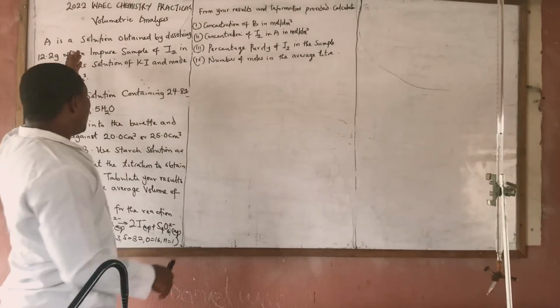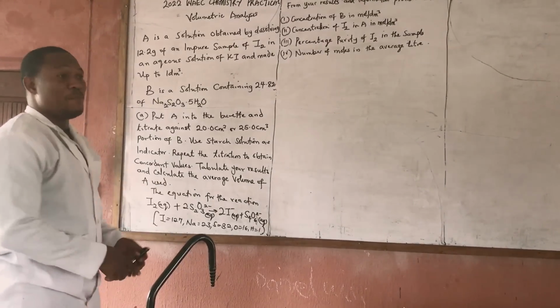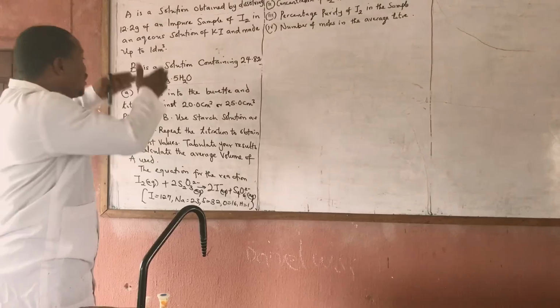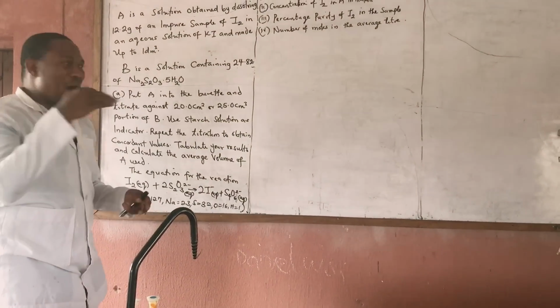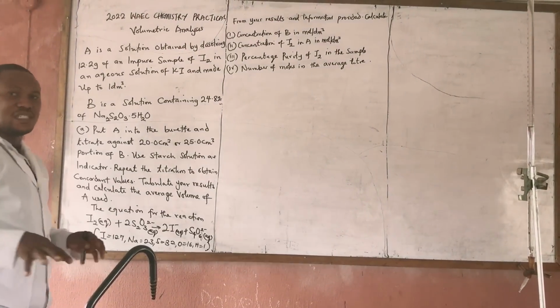I will demonstrate. So this is my prediction, based on what they are giving us. This is just a prediction of what to expect. But if you know how to do this, no matter how the question comes, it will still revolve around all these things. You should be able to do it on the day of the exam.